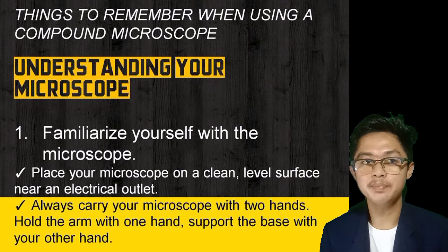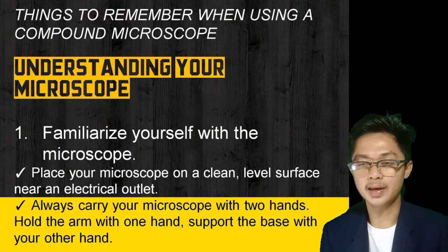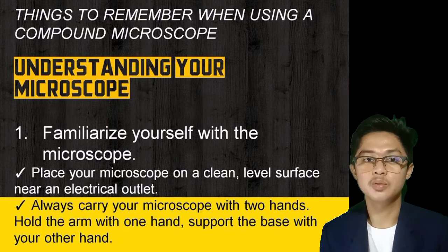The first step is to place your microscope on a clean, level surface near an electrical outlet. Always carry your microscope with 2 hands. Hold the arm with 1 hand. Support the base with your other hand.